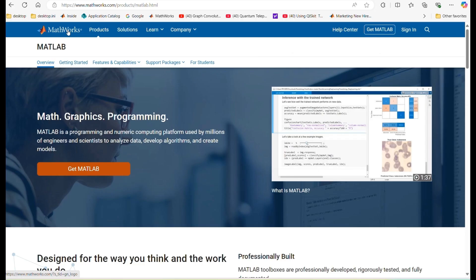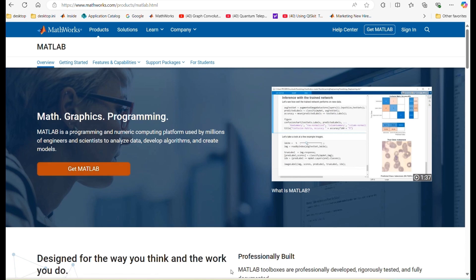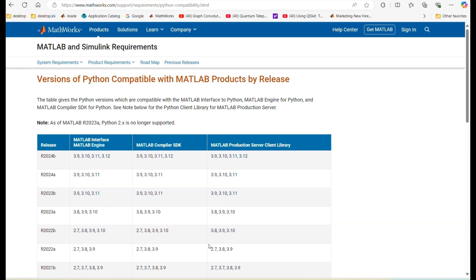First, I'll guide you through the essential steps to install the software requirements. If you don't have MATLAB yet, head over to mathworks.com to get your copy. Once you have MATLAB, ensure your Python version is compatible by checking the MathWorks website. I'm using version 3.11 for this example.